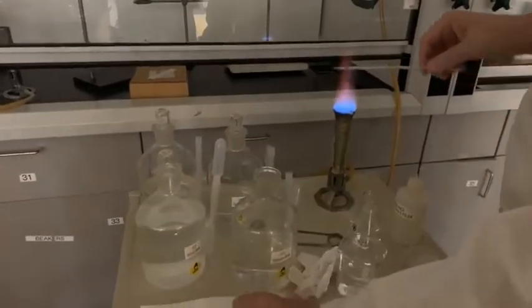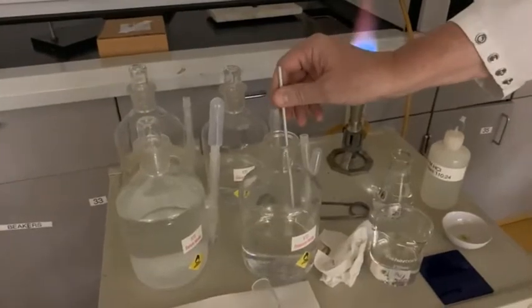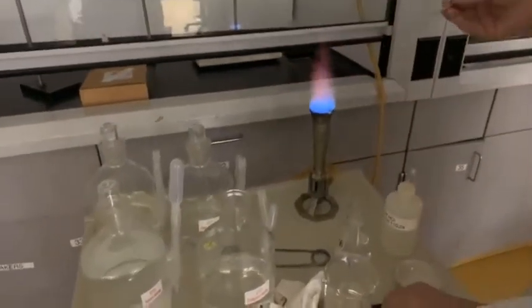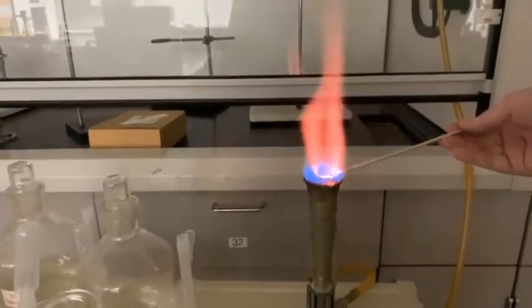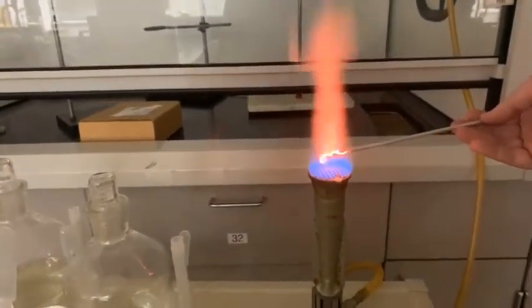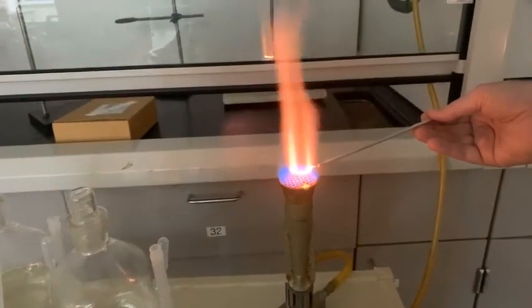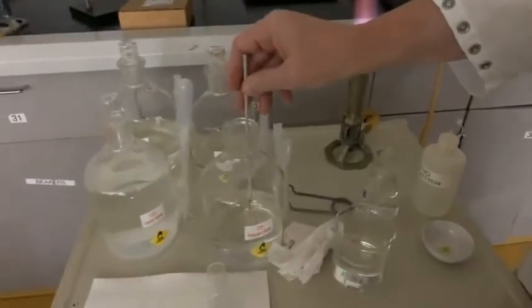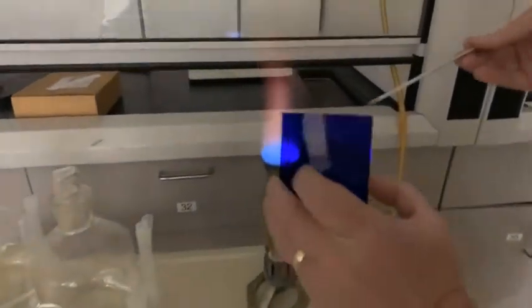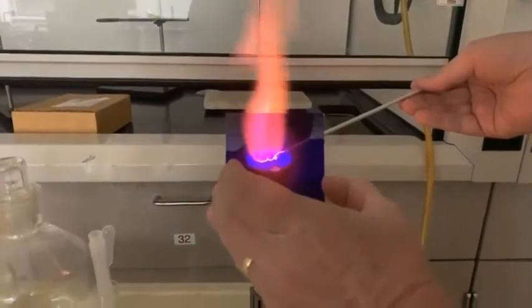So first, to show you the flame of potassium, we're going to take our wire loop, gently touch it to the liquid, and then hold it in the flame. And you see that bluish purple glow there for a second? That is the classic potassium flame glow. We're going to demonstrate it one more time, this time through the lens, and it gives a reddish glow through the lens. You see it glowing through the lens?